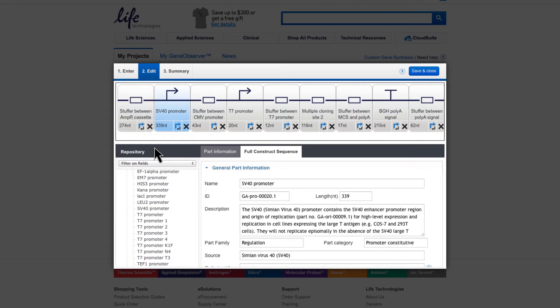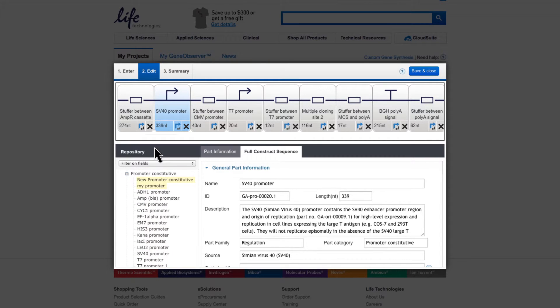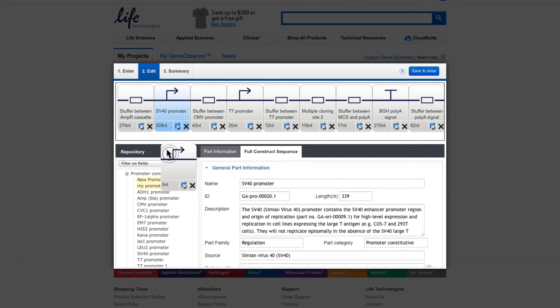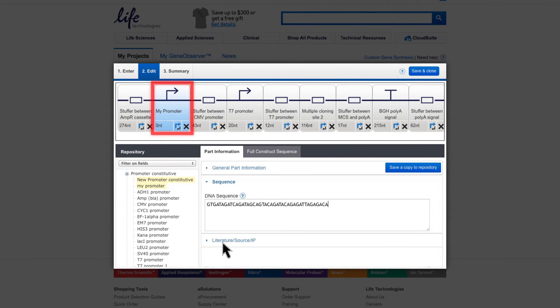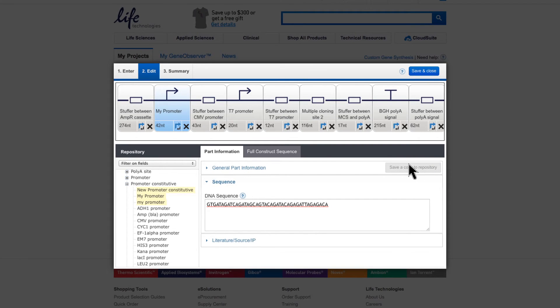You can also introduce your own parts into the repository by using the empty part templates within the repository. Dragging and dropping an empty part template onto the Construction pane allows you to fill in the specifications of your part within the Information pane. Now your custom element is part of the construct, and your part is also part of your private repository and may be used for future vector constructions.